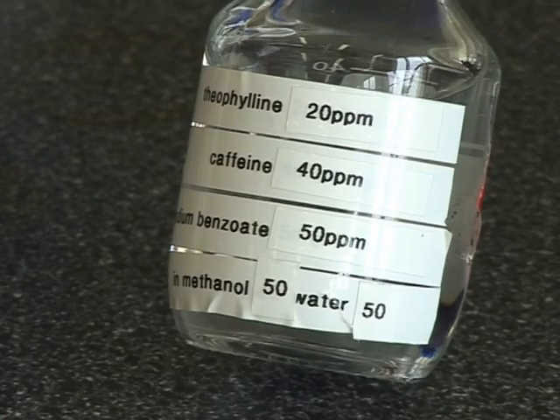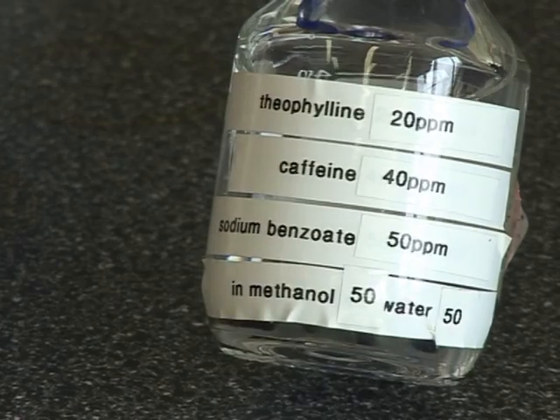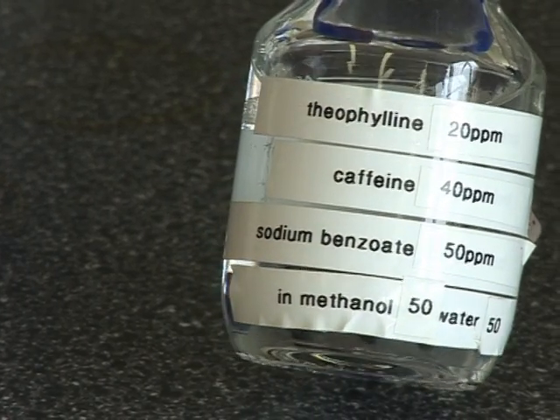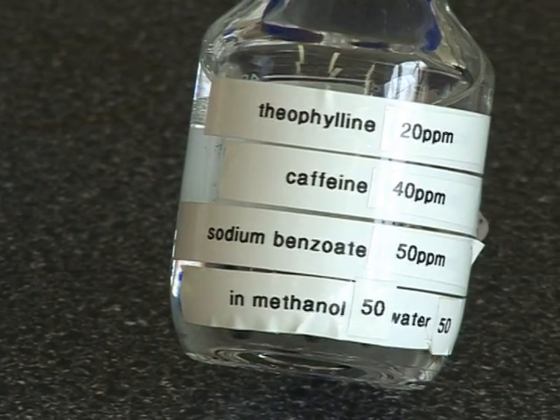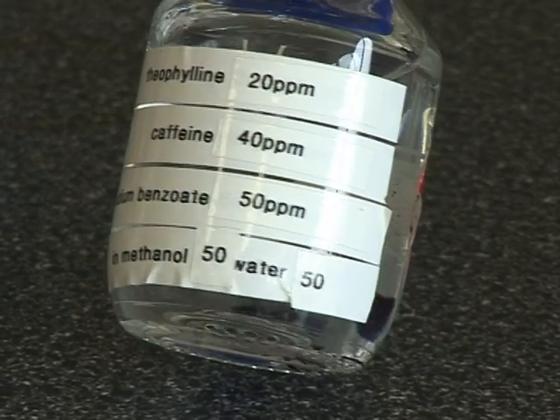You're also provided with a mix standard containing 20 parts per million theophylline, 40 parts per million of caffeine, and 50 parts per million of benzoate. This mix standard does not need to be diluted.